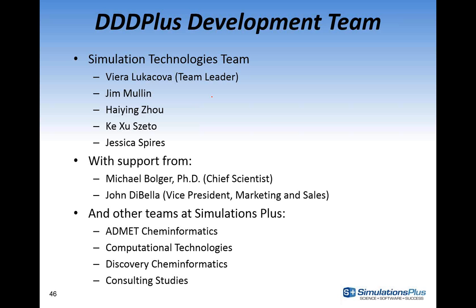There are a few questions that have come in. Once again, as a reminder, if you'd like to ask anything, be sure to write it into the questions pane on your GoToWebinar panel. A couple of questions have actually come in regarding the use of DDDPlus for non-oral products. So one of the first ones is, can DDDPlus be used for topical dosage forms? Yeah, currently, no.